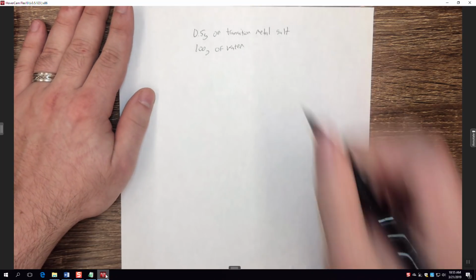Now you'll notice I said we're going to add it to 100 grams of water. We're not going to add it to a certain volume of water because we need to do this portion of the experiment in molality. The reason is that later on, the van 't Hoff factor calculation uses molality and not molarity. So your calculations, or your calibration curve and measurements, will need to be done in molality, not molarity, for this portion of the experiment.